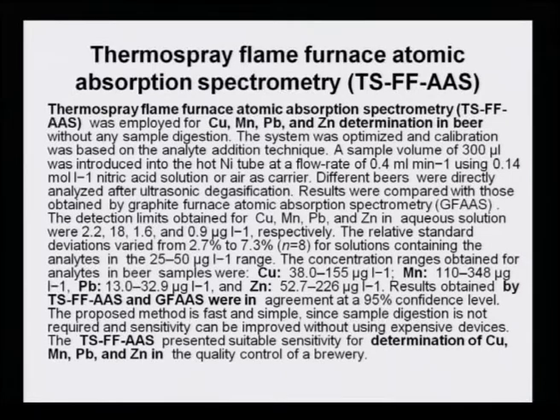The system was optimized and calibration was based on the analyte addition technique. A sample volume of 300 microliter was introduced into the hot nickel tube at a flow rate of 0.4 ml per minute using 0.14 mole per liter nitric acid solution or air as carrier.